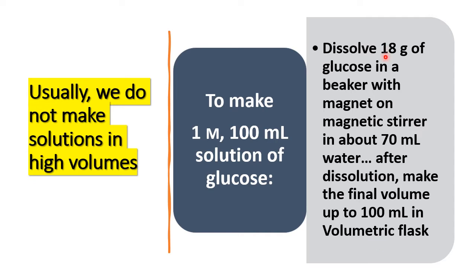So here what we have done is reduced the volume 10 times, from 1 liter to 100 ml. And similarly, you reduce all amounts in the same way. Rather than taking 180 gram, you just take 18 gram.